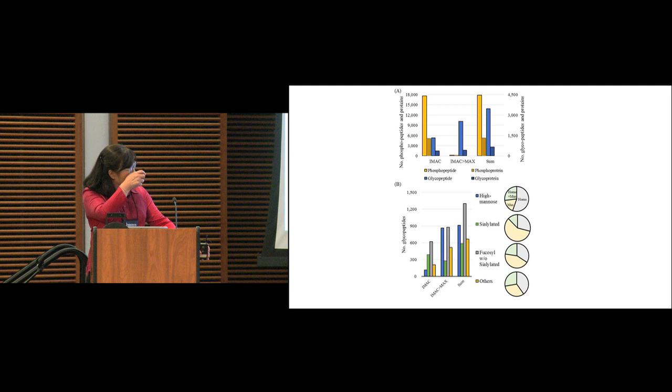I think this data shows some interesting biological phenomena. As we saw previously, IMAC itself enriches phospho with some glycopeptide co-enrichment. Further enrichment of the flow-through by hydrophilic enrichment can further enrich the rest of the glycopeptides. And this is the total glycopeptides and phosphopeptides identified and quantified through this strategy. In IMAC, you can see the neutral glycan-containing peptides, like oligomannose glycan and the other glycans, are enriched at a lower efficiency, and can be further enriched from the flow-through by the hydrophilic cartridge. So the oligomannose glycopeptides and the other neutral glycans are enriched.